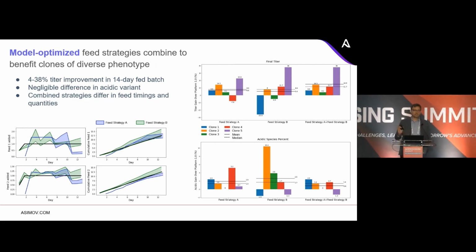They're VCD-based feed strategies, so there's a little bit of variability depending on how those cells grow in the actual feed. But you can see for our two medias that we feed, both of them will predict that we want to feed a little bit less in the early exponential phase, support growth and stationary phase pretty well by overfeeding a little bit, but then they diverge in their strategy in the decline phase, where one feed strategy looks like it wants to be fairly close to our baseline, and the other strategy wants to feed much less in the decline phase.